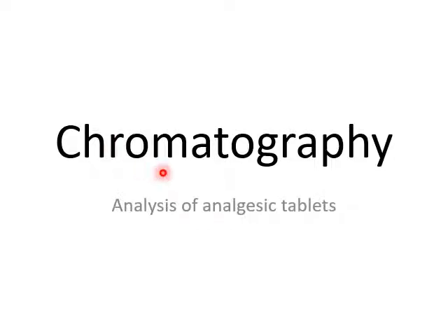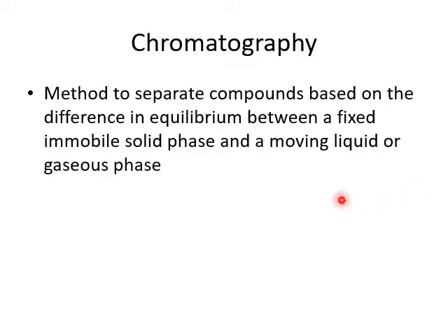Hello everyone. So your experiment today, your class today, is going to be about chromatography. Chromatography is a separation method. In chromatography methods, usually you separate several compounds based on the difference in equilibrium between a stationary phase and a mobile phase.